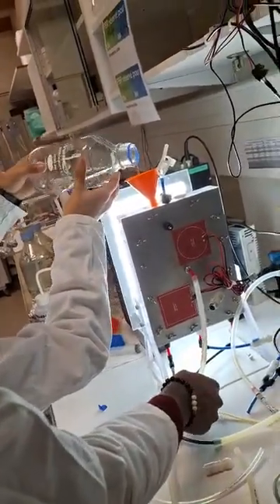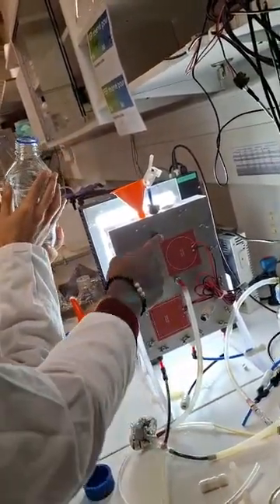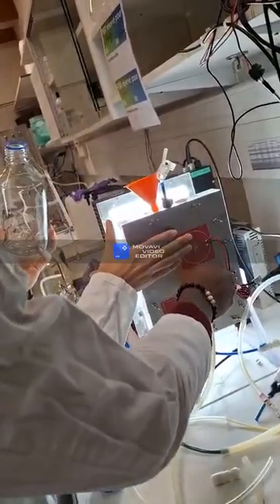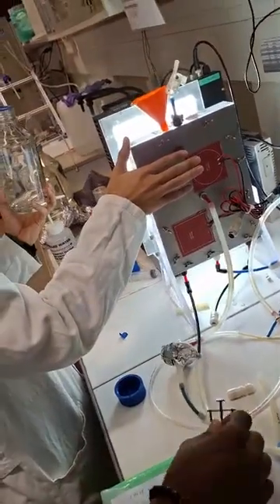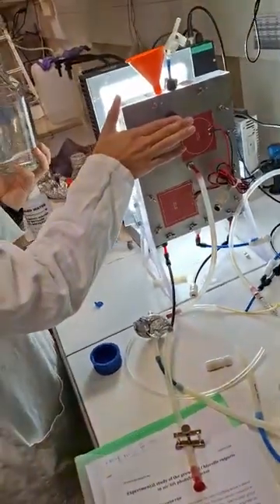Oh, you have a leak, for example, here and here too. This is not a good place. It's my fault.